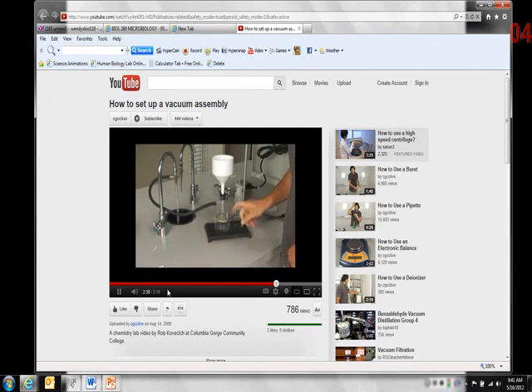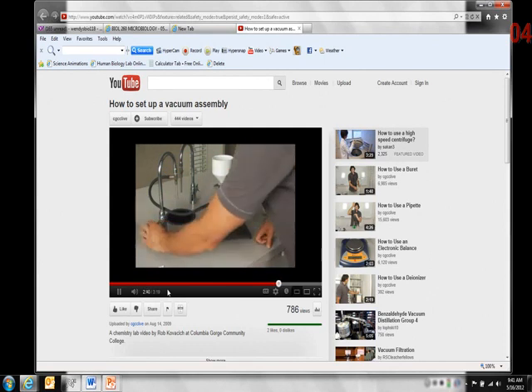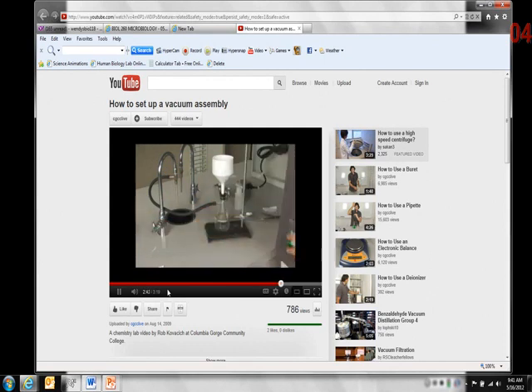And you can see water dripping through here. Turn this off and we'll try with a colored solution. The solution I have here is simply food coloring and water. When I place it into the filter, we see nothing coming through. No dripping at all. Now just very slight dripping, not very much. But when I turn on my sink, the fluid flows freely and our solution is filtered in seconds instead of minutes.